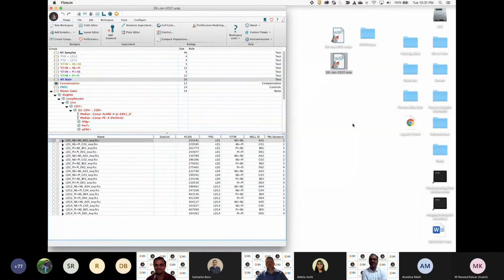I know it takes a lot longer when I actually point and click and show you everything that I'm doing, but I think it's important to show the actual interaction, and a lot of these functions make a lot more sense than just a slide.